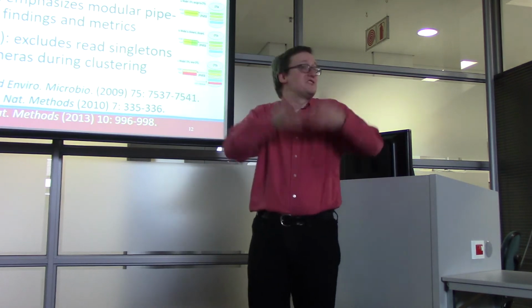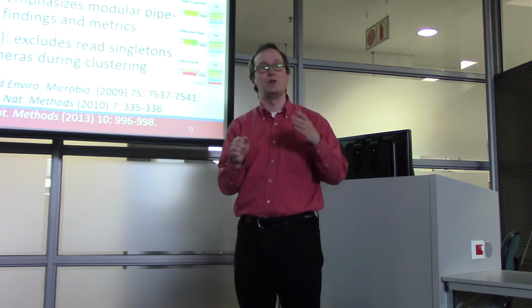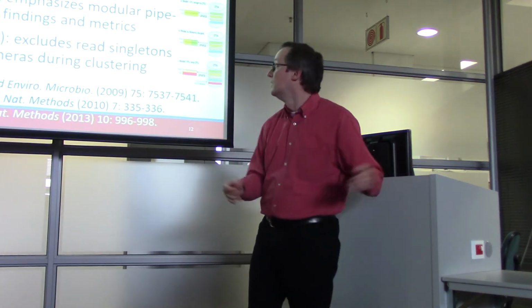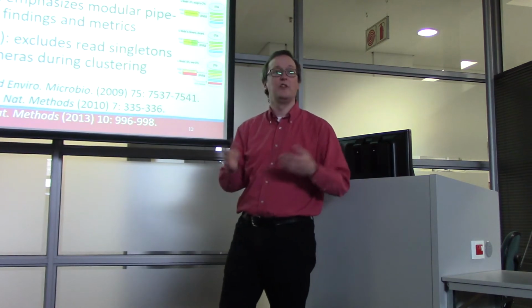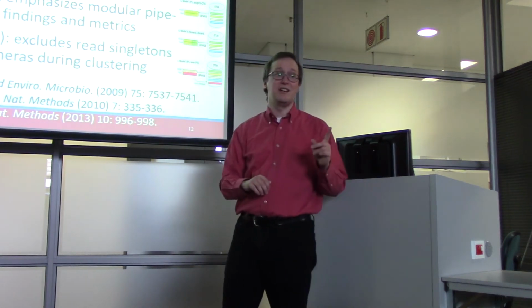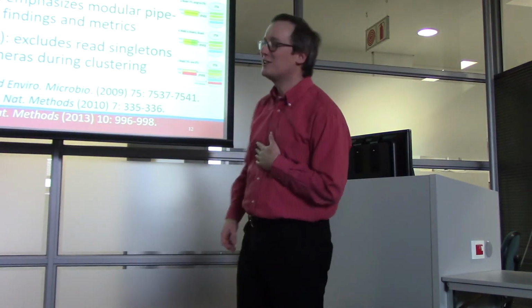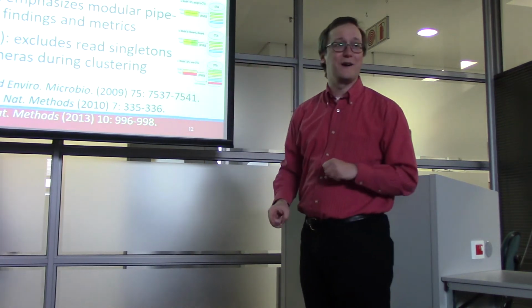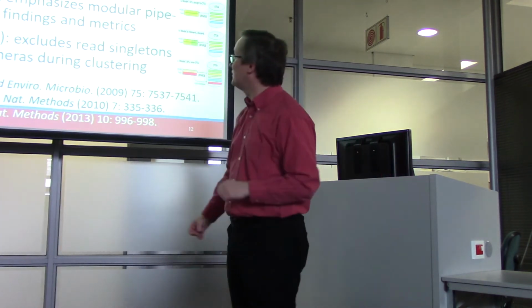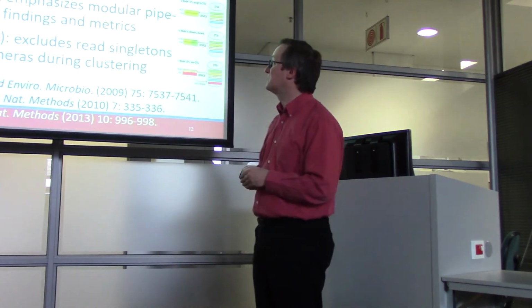Anyway, 97% is the rule that we mostly use. Mothur is designed to evaluate what this clustering would look like with all kinds of different boundaries, though. So that's a helpful feature. And it does a fair bit of reporting on the diversity that comes out of it. I also have to say, they have a sweet logo. Take a look at that thing on the upper left-hand corner. Doesn't it look like someone caring for the data? I think that's just really beautiful. All right, well, anyway, so they have a good graphic artist. They have pretty good software. They published early 2009, and they own a fair bit of the next-gen sequencing space.